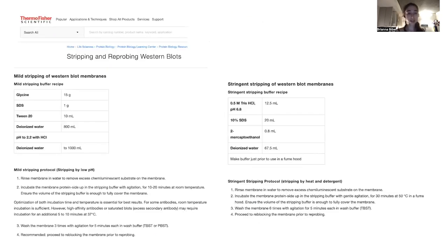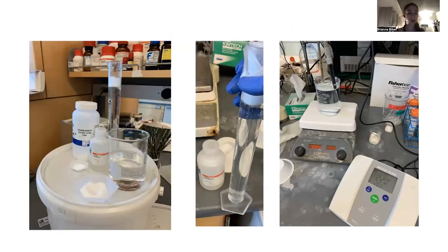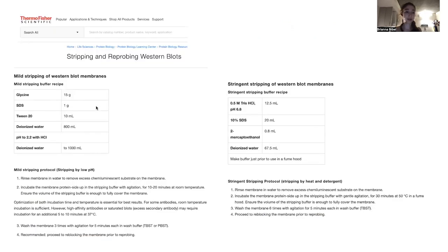Just a little more detail about how you actually go about making this mix. The stripping buffer that I used has glycine, which is going to allow us to buffer at a low pH, which we get with HCl, hydrochloric acid, along with SDS, Tween, and water.